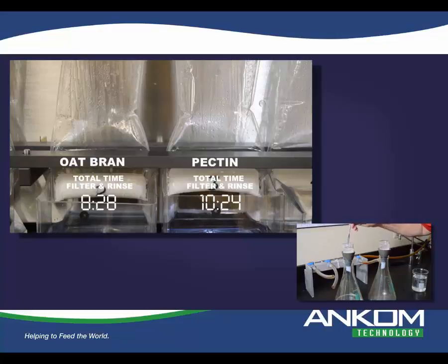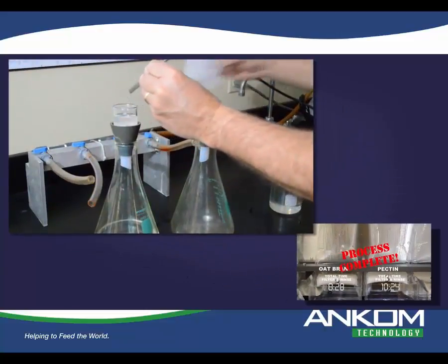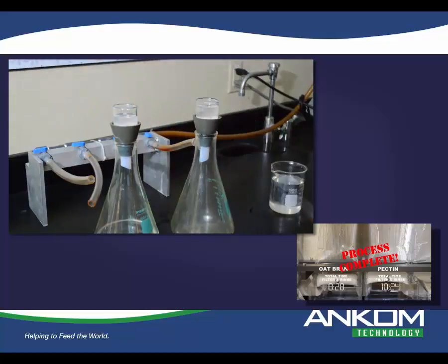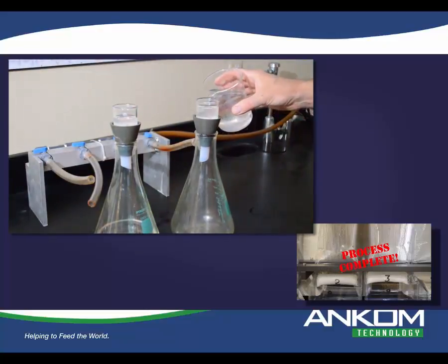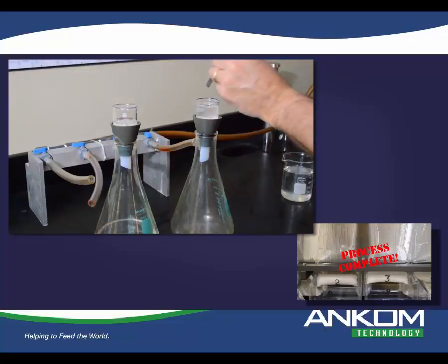So that's a critical issue. I would say probably one of the most impactful elements of the conventional method is how they handle filtration. I always tell stories about some of the things I've witnessed in laboratories around the world, and one of the things that surprises me is how often people, because they get so frustrated with the length of time it's taking them to filter, dig deeper and deeper into that diatomaceous earth in order to increase the filtration process.